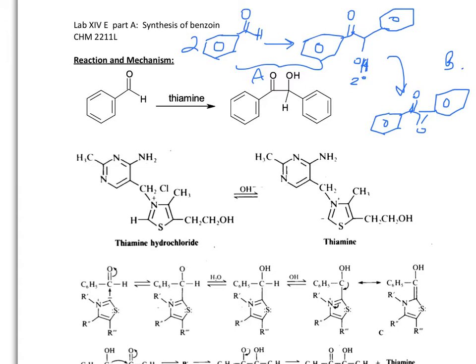All right, so the way the reaction will proceed, and just a couple things about it. First things first, what kind of an aldehyde will go through the benzoin condensation reaction? The kind of aldehyde which does not contain an alpha proton or an alpha hydrogen.